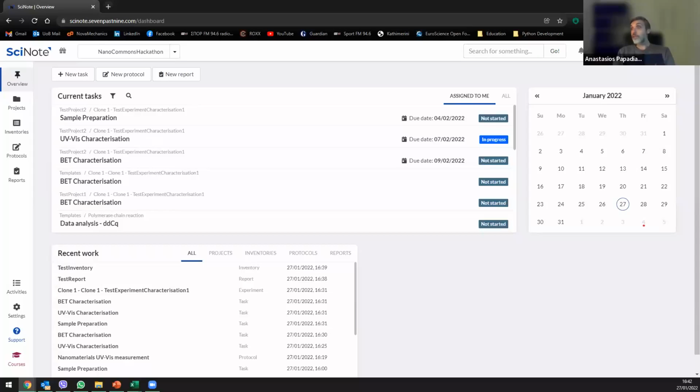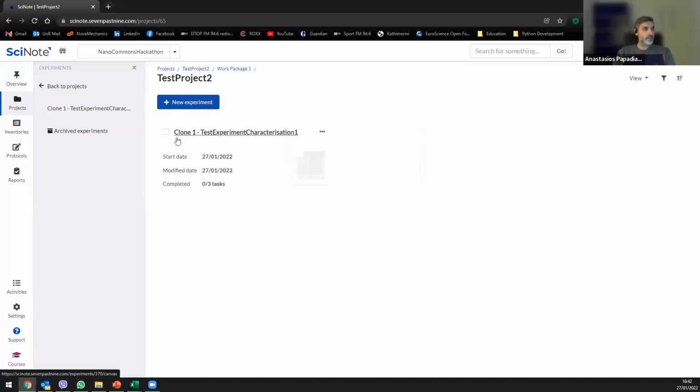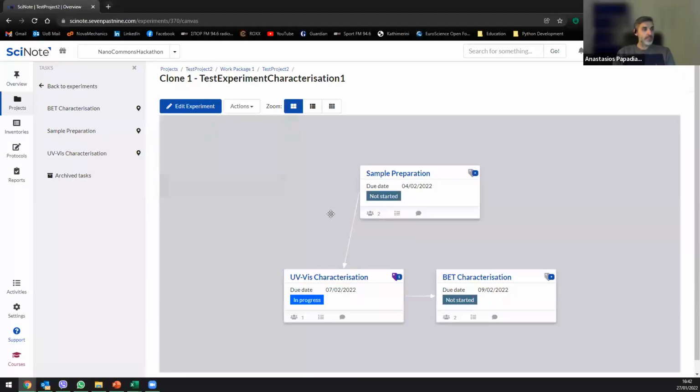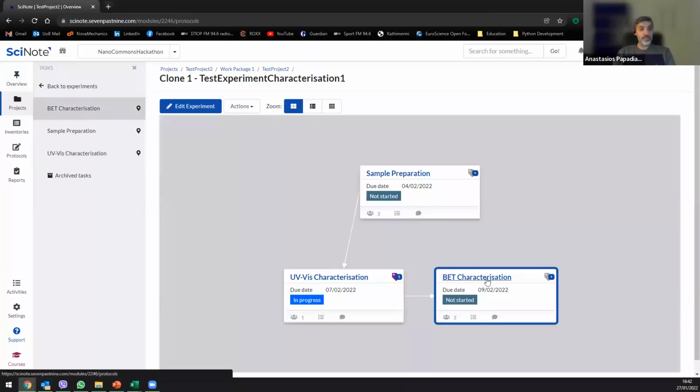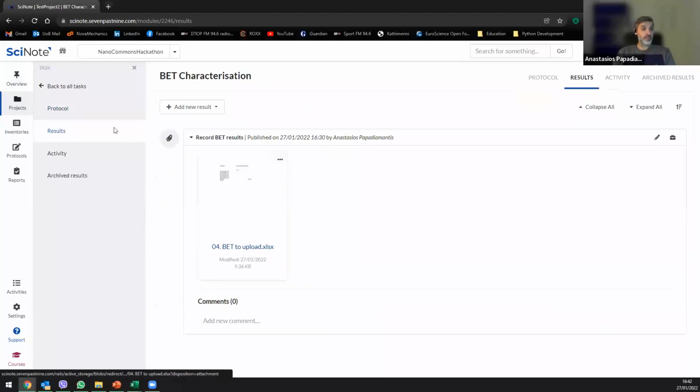Okay. If anyone would like, yes, you can upload the same way as we said. If you go into your tasks, let's say, again, image data, you can upload them into the results section as a file. And that was going to be my comment.